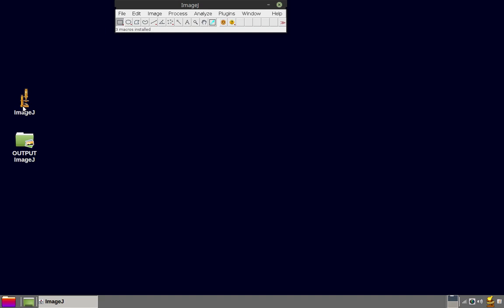Upon ImageJ startup, two buttons are visible. The question mark Help button provides two options. Selecting Documentation opens a browser window with the custom macros manual. Selecting Shortcuts opens a dialog in ImageJ with a table of keyboard and button press shortcuts used in the various procedures.